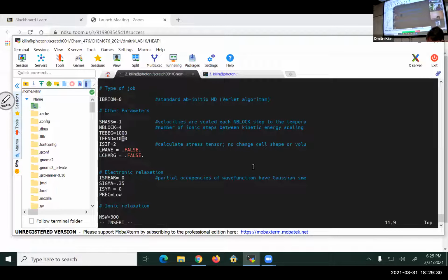Beginning and end. If any of you are synthesizing thin films for semiconductors and insulators, like solid materials, there are programmed ovens, where one carefully ramps temperature, not instantaneously, to avoid cracks.